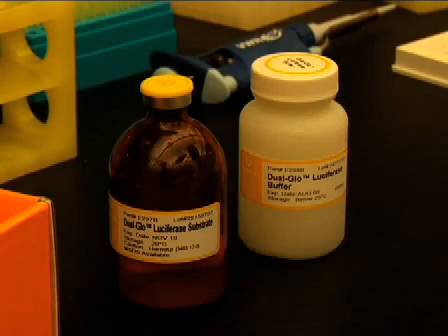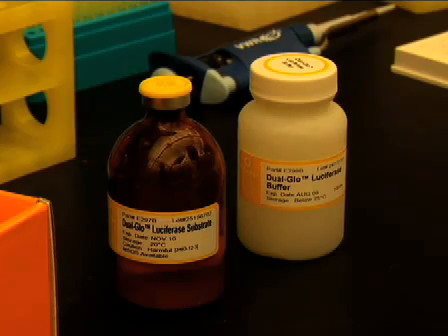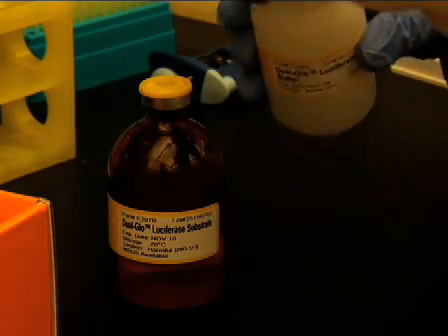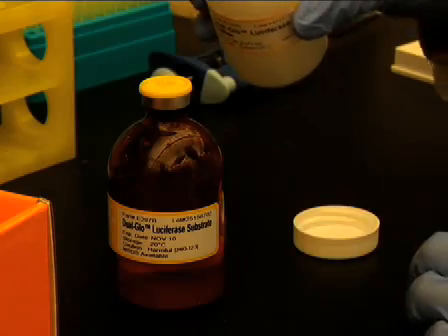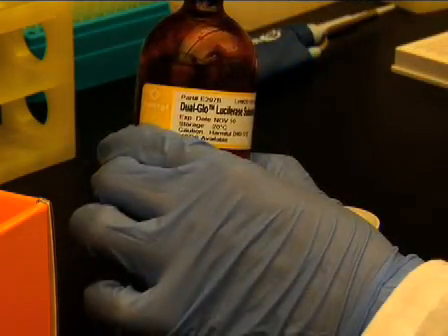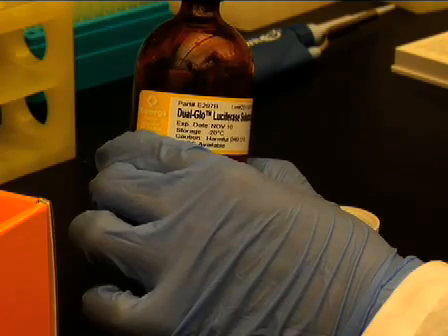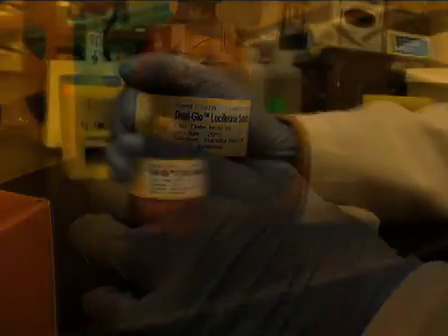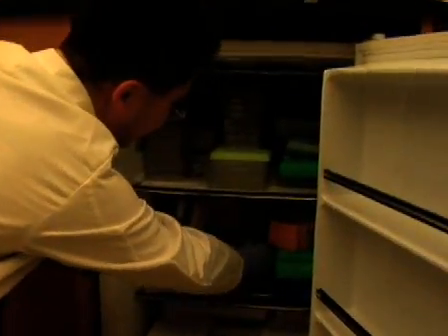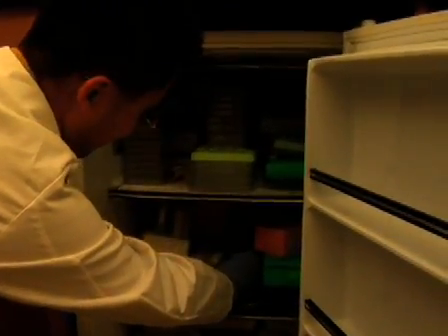When using the Dual-Glo kit for the first time, prepare the firefly luciferase reagent by transferring the entire contents of 1 bottle of Dual-Glo luciferase buffer to 1 bottle of Dual-Glo luciferase substrate. Divide the unused luciferase reagent into 10 ml aliquots and store at -20 degrees C.